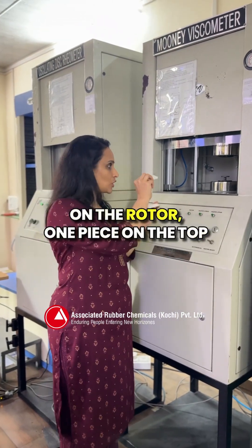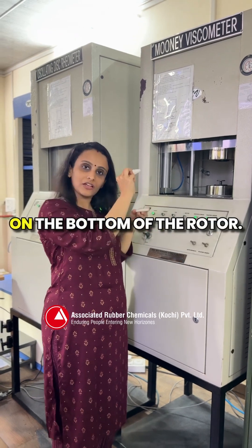We place the specimen on the rotor — one piece on the top of the rotor and another piece on the bottom of the rotor.